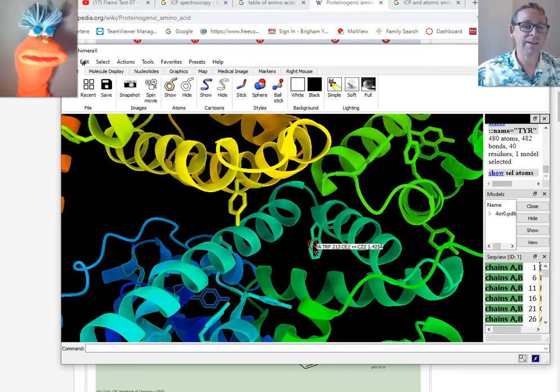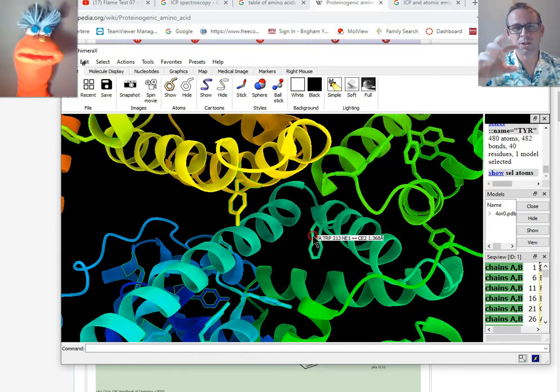So again, we have another sensitive component in terms of fluorescence: tryptophan's proximity to other fluorescent, or even slightly, even significantly less fluorescent, subgroups or residues, right? Side chains. So that's another parameter that will change every time the protein moves. Now, in general, the protein is just always constantly moving, right? And you get an average of all the fluorescence. But if you do something that causes the protein to change significantly, then it'll be moving still, but the fluorescent signal will shift, okay?